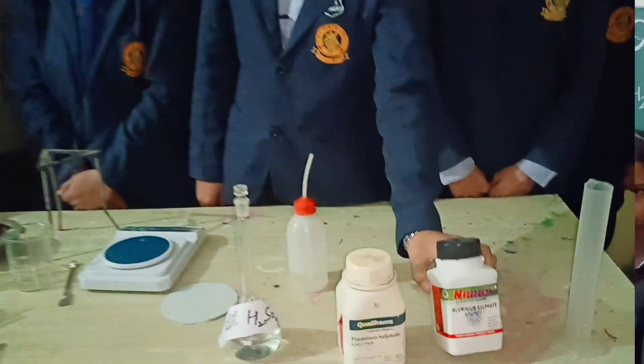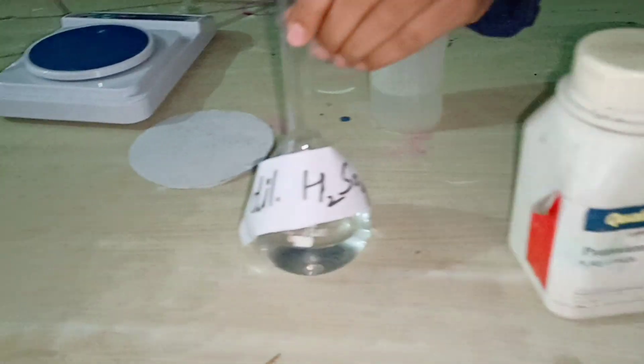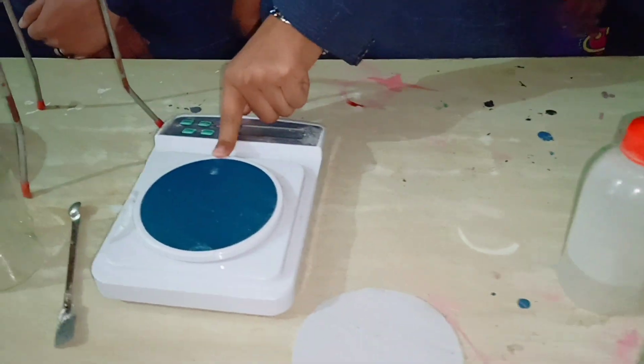Materials required: this is aluminium sulphate, this is potassium sulphate, dilute H₂SO₄, distilled water, filter paper, weight machine, and spatula.